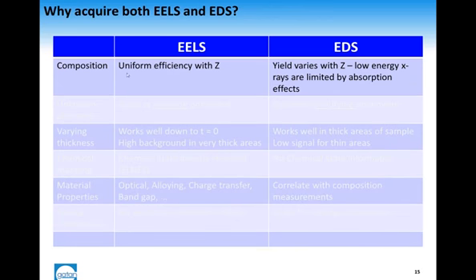If we look at the composition, we were always taught since the beginning that you want to use EDS for heavy elements, EELS for light elements. Things are now different, because the development of the GIF Quantum improved the camera by a lot, the readout of the camera, the performance of the camera. So now we can get EELS data in a fast manner from high energy edges, so basically from heavy elements.